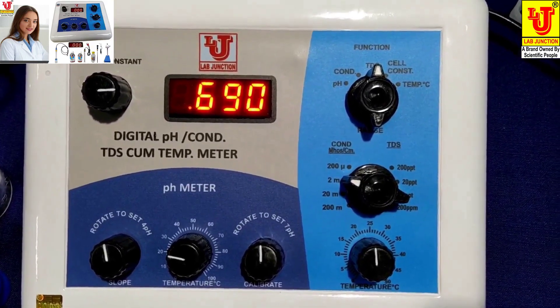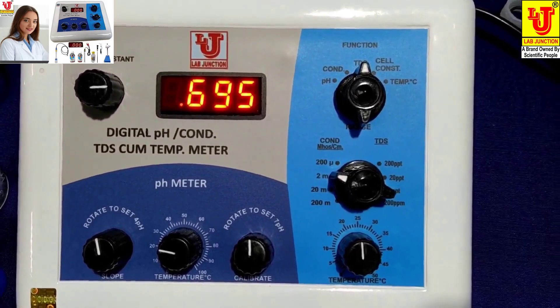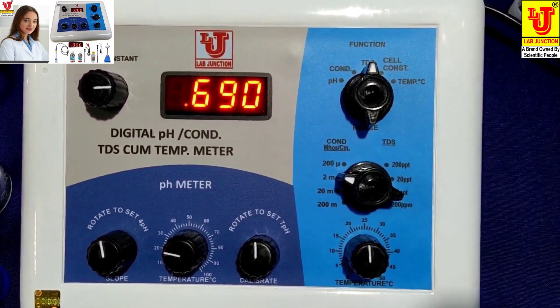Whichever parameter you want, select it from the function control: pH, conductivity, TDS, and temperature.